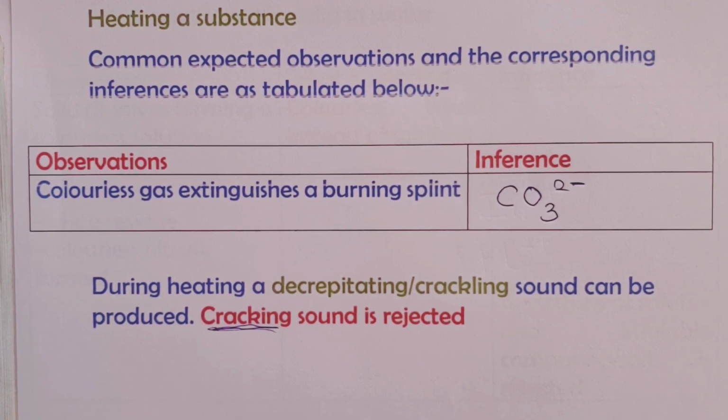We are through with heating substances. We've looked at expected observations and the corresponding inferences a candidate is supposed to make. Let's now move on to solubility of substances in water.